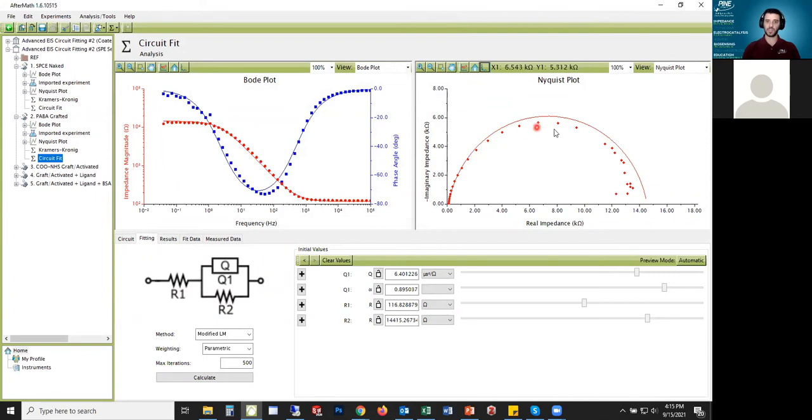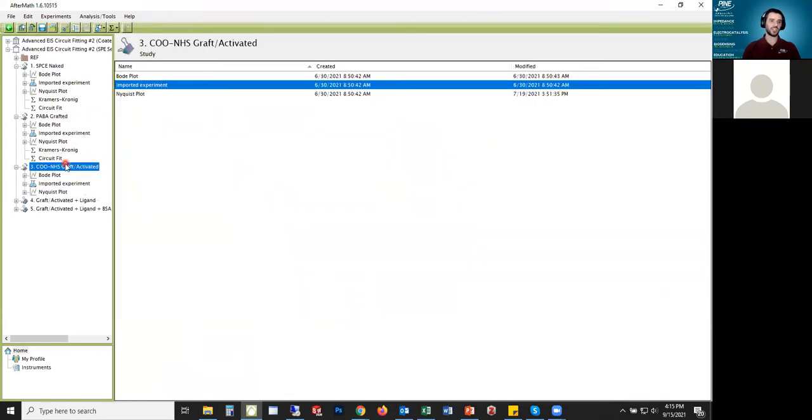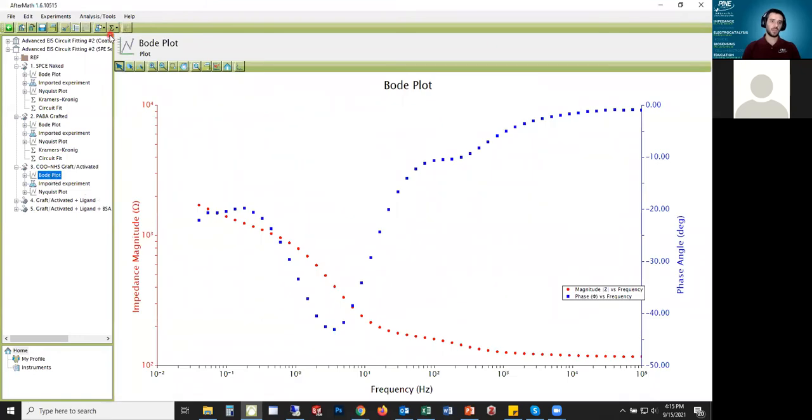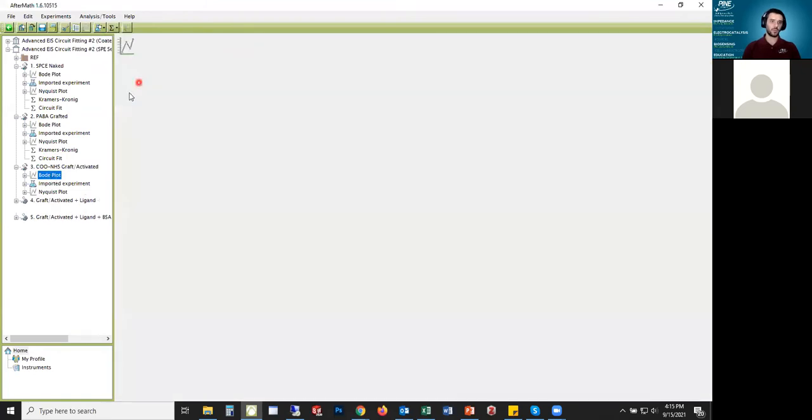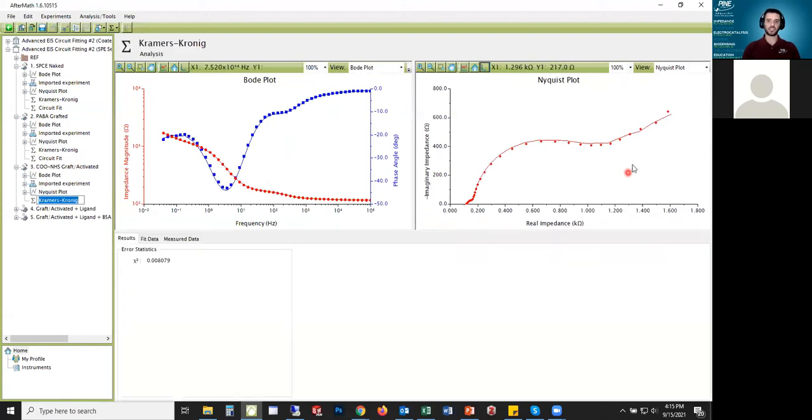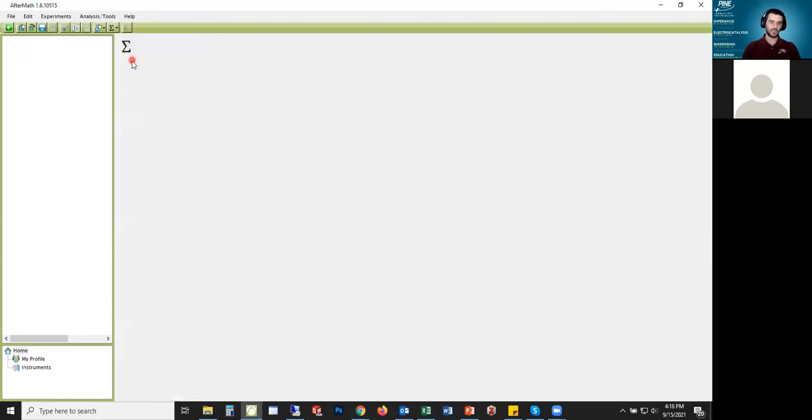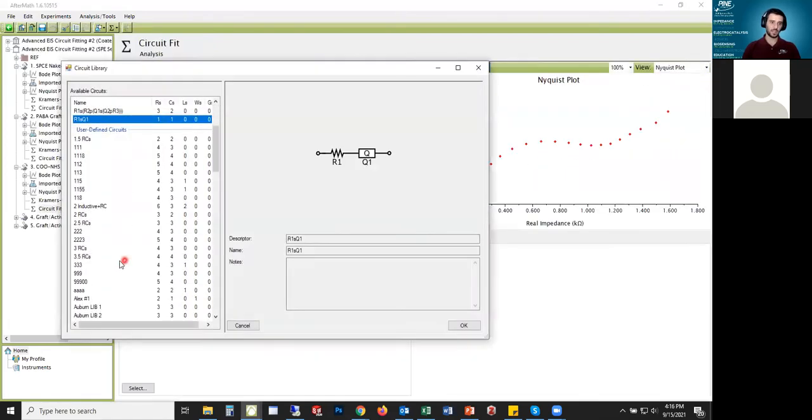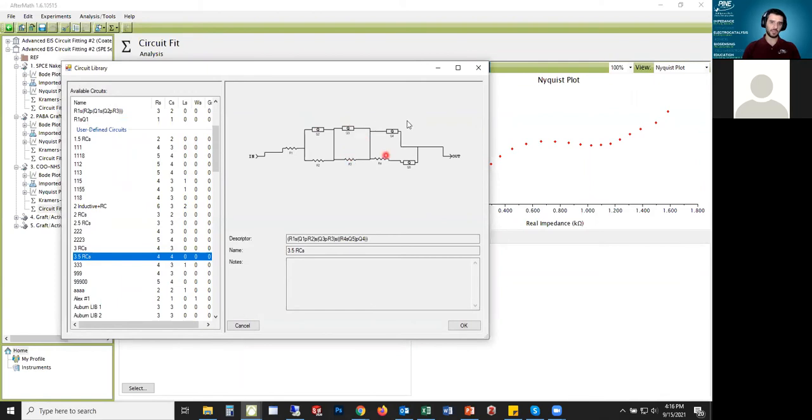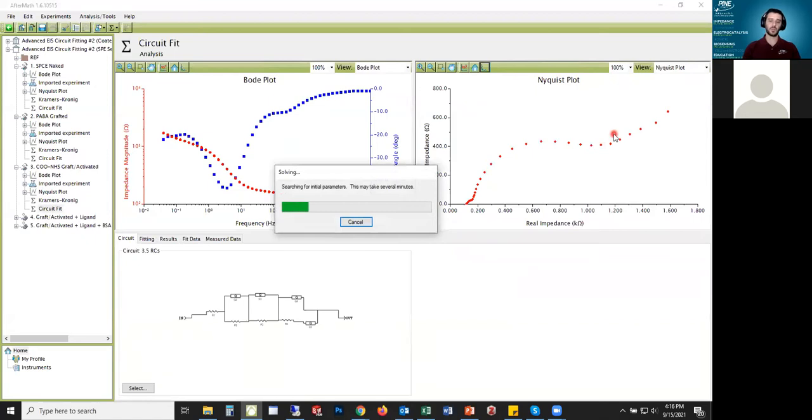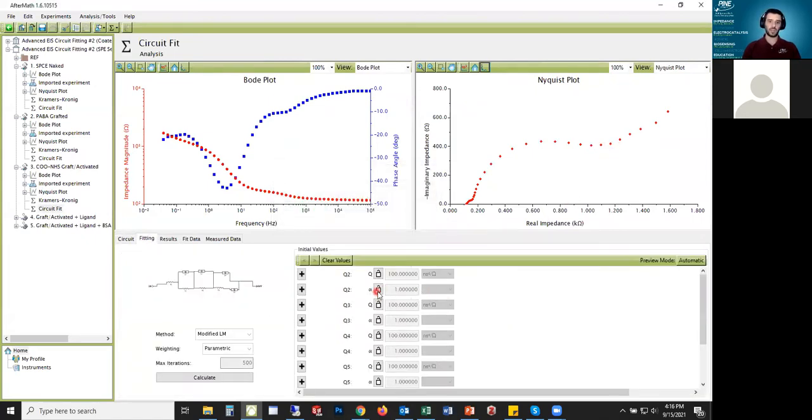The third stage was a little more interesting actually. The grafted activated with this NHS ester, you see a little bit of drift at low frequency. But for sure more things are going on here. It looks like we kind of have one, two, three and a half Randalls elements. And so the circuit that I fit for this would be just that. I would have one, two, three Randalls elements with an extra CPE or Warburg, almost like Warburg element for diffusion.